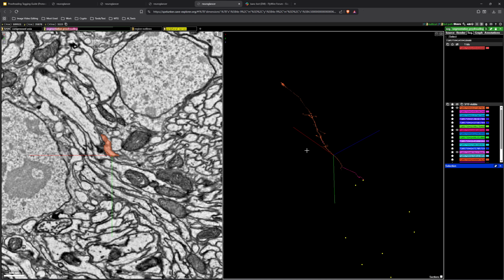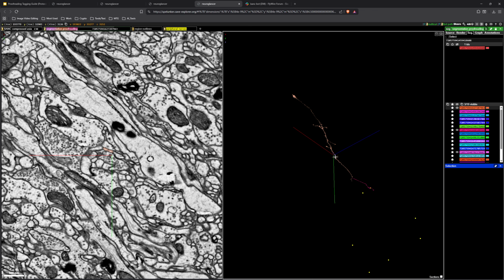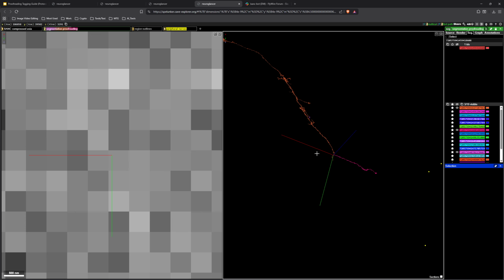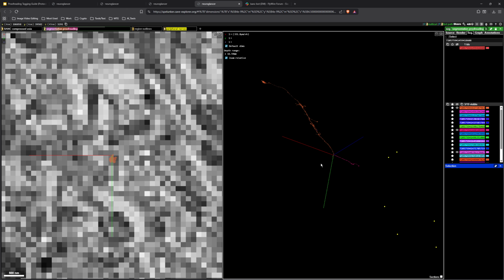There are 800 of each of these specific types as well, and there are many different subtypes within a type. So if you do like 800 of these, you'll be good to go, or at least you'll be able to recognize, oh, okay, I know that there should be more. It's probably just very thin, and there's not usually any damage in these regions. There is some difficult area stuff.